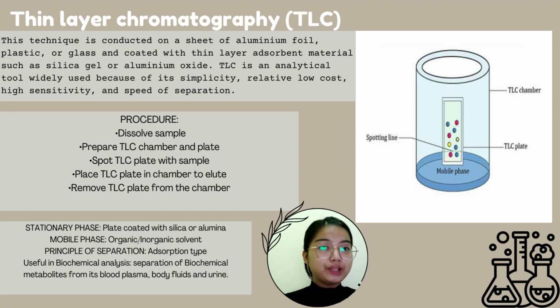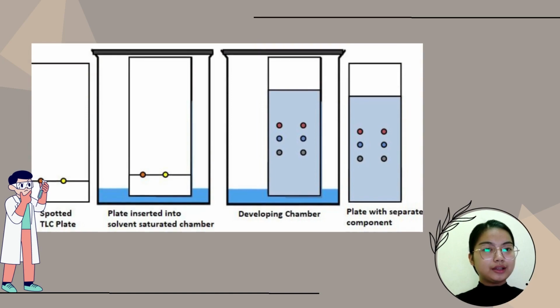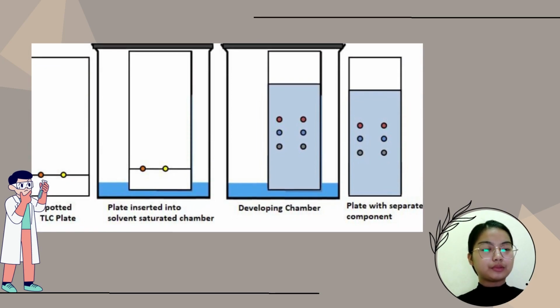TLC is useful in biochemical analysis, such as separation of biochemical metabolites from blood plasma, body fluids, and urine. This is what a diagram of thin layer chromatography looks like.